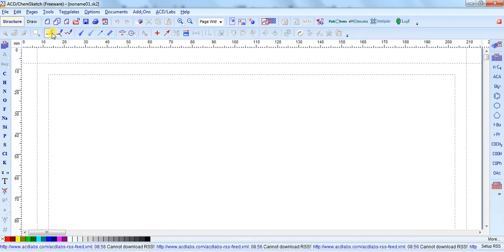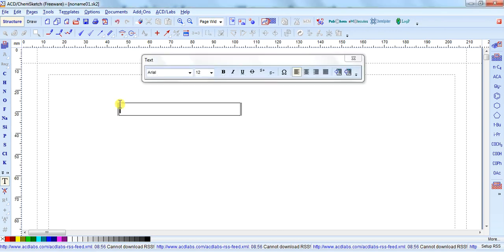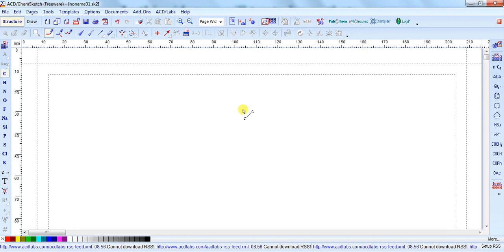So here are some icons. These are different elements, and if you want to write something, you can also take this and write whatever name you want to use. This is the drawing tool for the normal bond, or these are for drawing different bond types — these are the bond types for stereo or anti-stereo — and these are the arrow tools. You can use them in your structure while drawing.